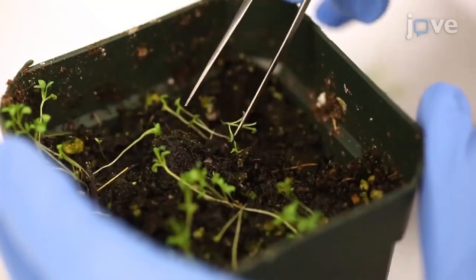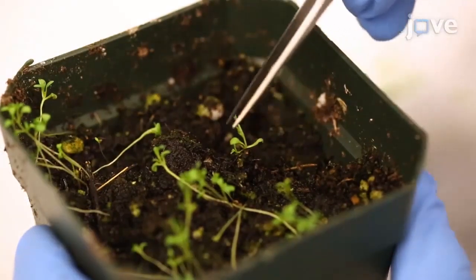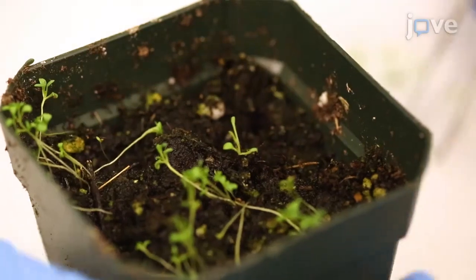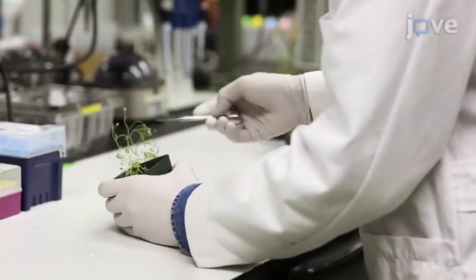Once all of the seedlings have germinated, leave only one seedling in each of the four corners and at the center of the pots. Grow the plants for 8 to 10 weeks in the growth chamber until they flower. On the day of transformation, select S. parvula plants.